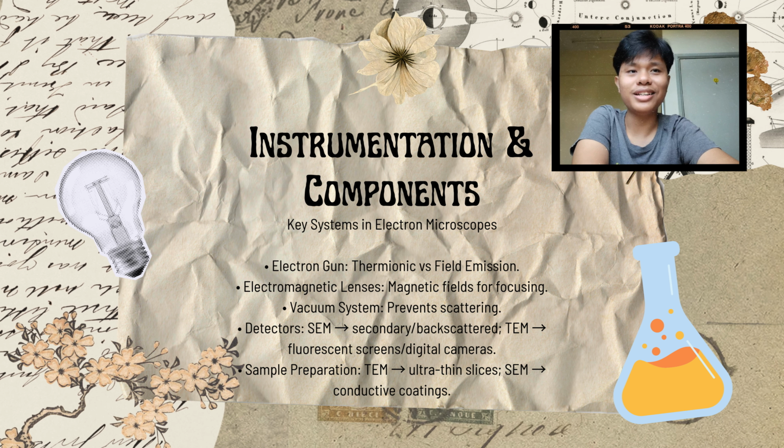Key systems in the electron microscope are the electron gun, electromagnetic lenses, vacuum system, detectors, and sample preparation. For the electron gun, the details are thermionic versus field emission, and for the lenses, magnetic fields for focusing.